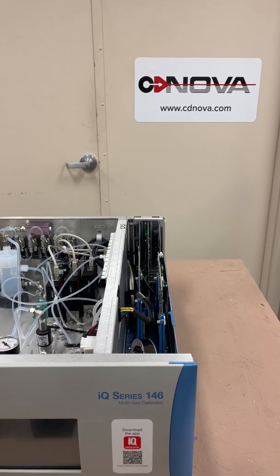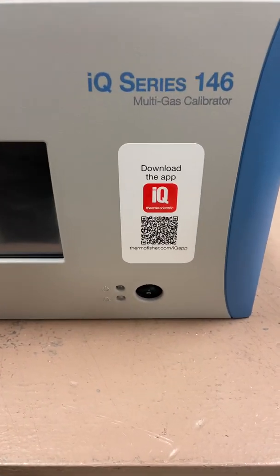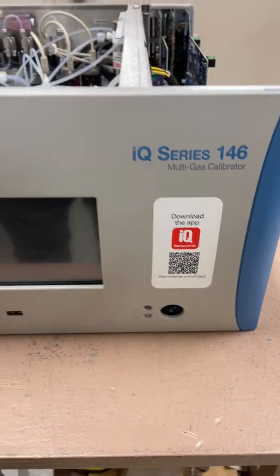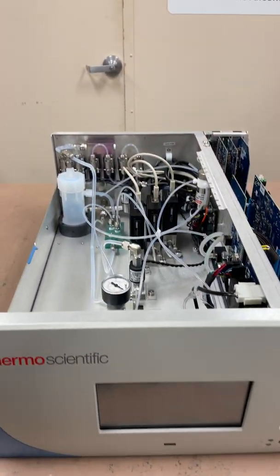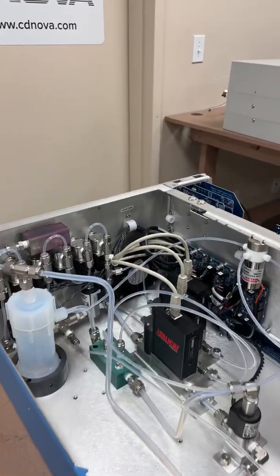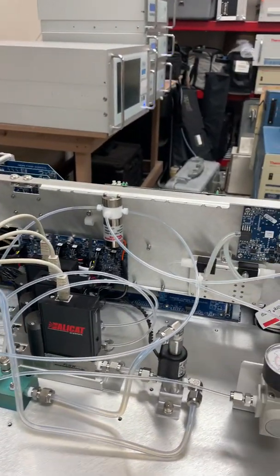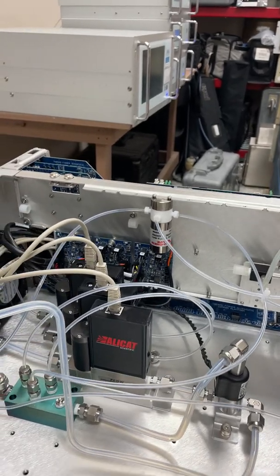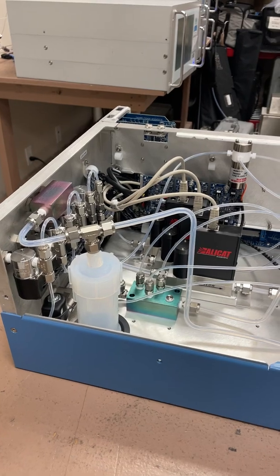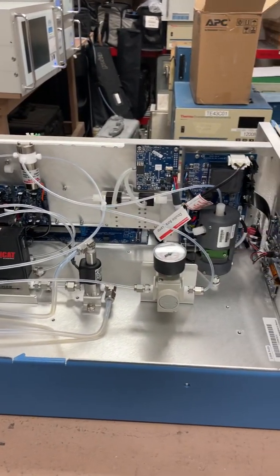Hi everyone, Jim with CDNova again. Today we're looking at the Thermo Scientific 146IQ multi-gas calibrator. This unit is a dilution calibrator, which means you can take cylinder gas concentrations such as SO2 and mix it with clean, contaminant-free zero air to create a known concentration that you can use to calibrate your SO2 analyzer, H2S, NOx, methane, CO, CO2 — that sort of thing.